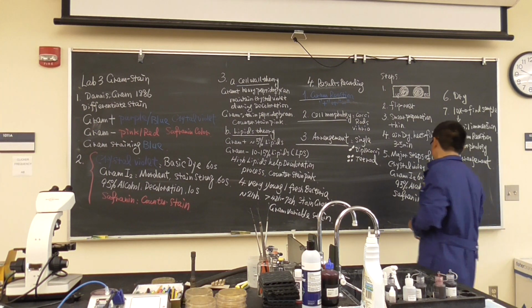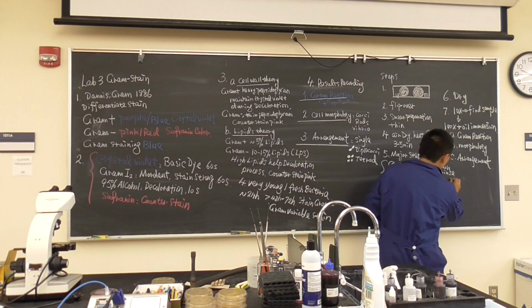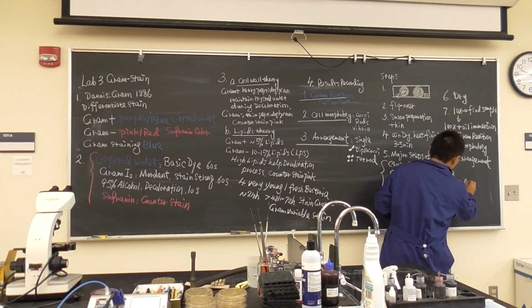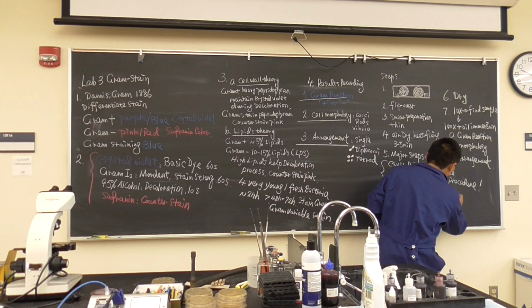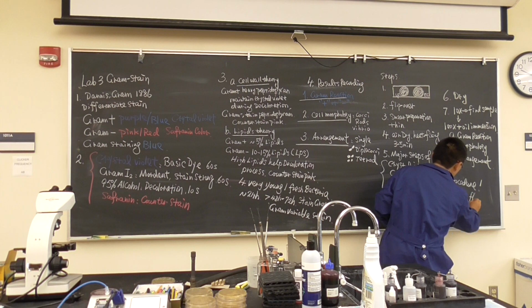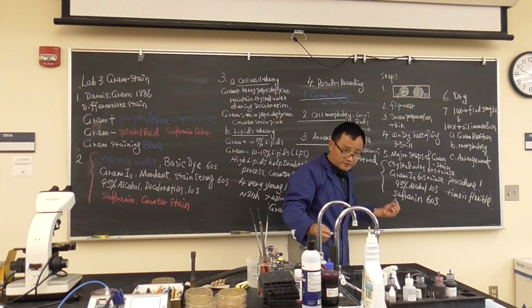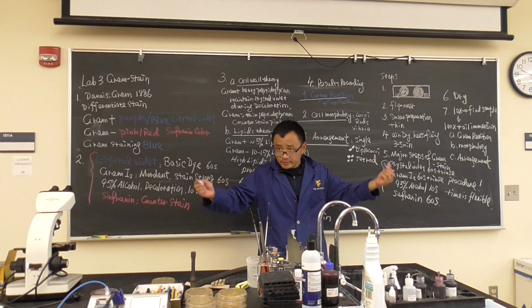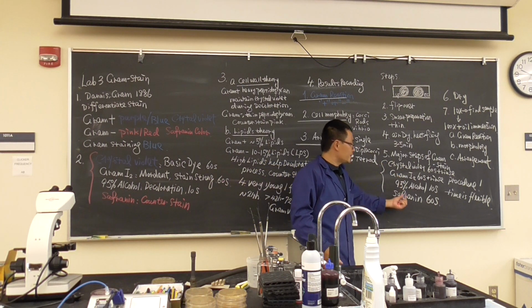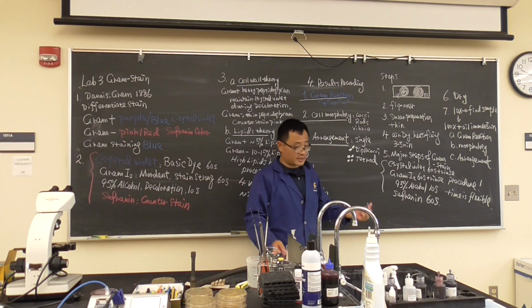The last thing I already mentioned in the lecture, we're going to emphasize here: the procedure you have to follow. The procedure is important. The time is flexible. Which means you may stay in only 45 seconds, that's okay. You stay in 90 seconds, maybe okay, but you cannot mess up the steps. If you mess up the steps, the results will be totally different. Okay, so that's the key.